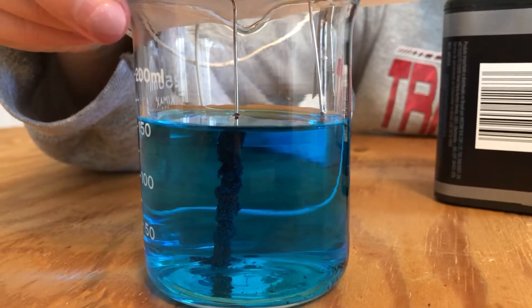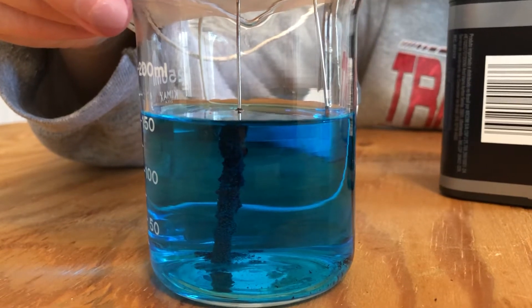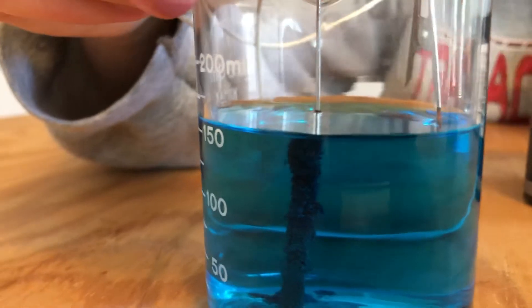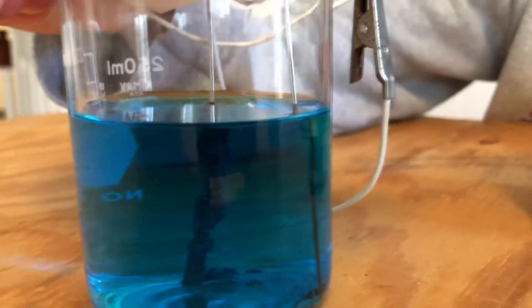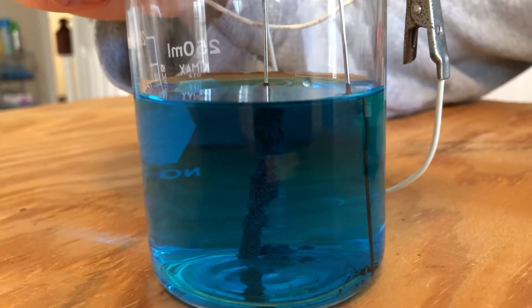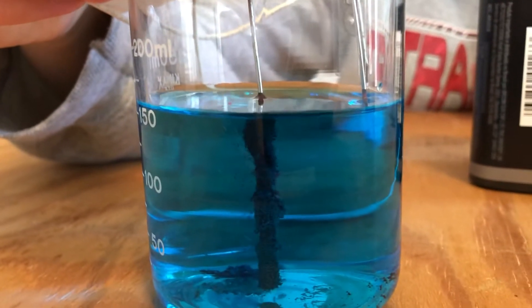All right, as you can see, our two electrodes have been in the cupric chloride solution for about the last three minutes. Quite a change has happened. You might have noticed the start of some discoloration when I first put my electrodes into the solution, but now notice how the two electrodes appear different.